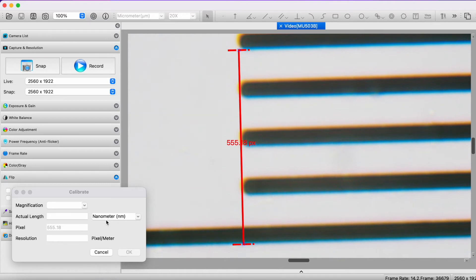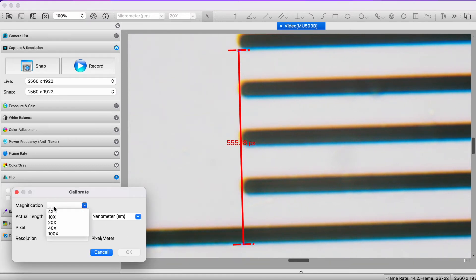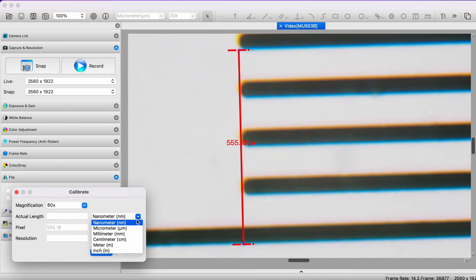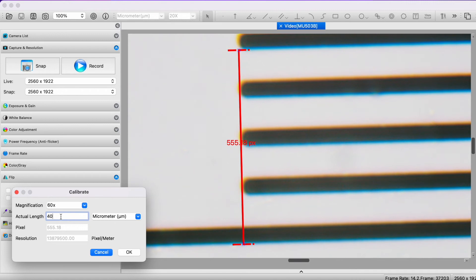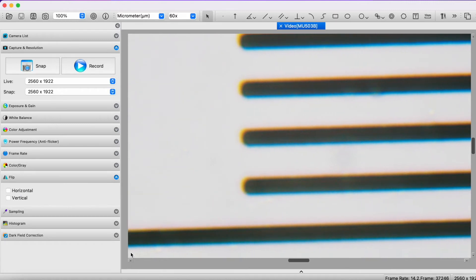Now I'm going to choose the magnification. You'll see it doesn't say 60 times, but all you have to do is enter 60x. Now I'm asked to put in the actual length in microns. The actual length is four divisions, and each division is 10 microns, so I've got 40 microns in length. Click OK, and we're all set.